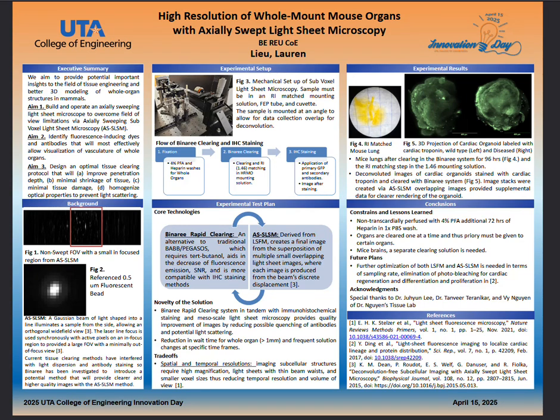Lauren, and today I will be presenting high resolution imaging of whole mount mouse organs with axially swept light sheet microscopy.